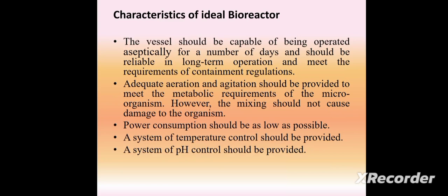Now we switch over to the characteristics of an ideal bioreactor. The ideal bioreactor or vessel should be capable of being operated aseptically. It means the aseptic condition must be maintained within the bioreactor to avoid any type of contamination, as within any fermentation process we are utilizing pure cultures, so there should be no chances for contamination within that vessel.